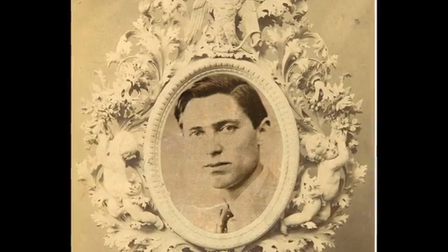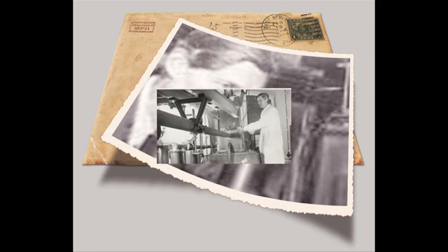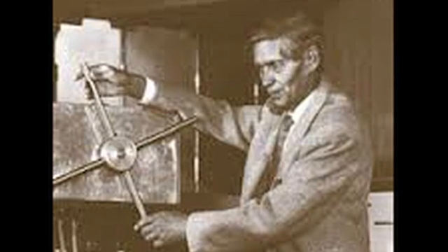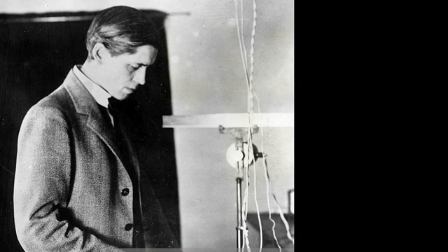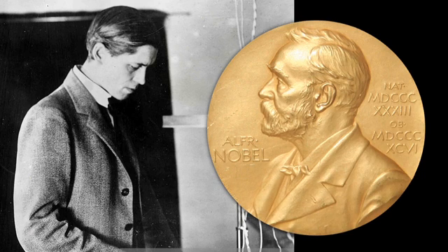The Roaring Twenties were a time of great prosperity. As the flappers broke gender barriers and talkies changed the way movies were made, Theodore Svedberg was breaking new ground in the way we study molecules. Svedberg invented the analytical ultracentrifuge in 1925 to assist his research on colloids and proteins. For his invention and work on dispersed systems, Svedberg was awarded the Nobel Prize for Chemistry in 1926.